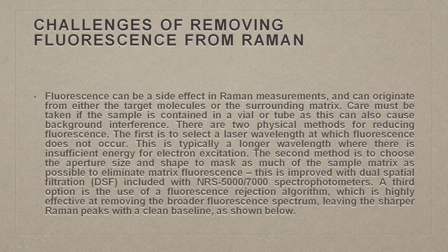So, challenges that Raman faces. Raman spectroscopy comes with a very interesting challenge of fluorescence. There is always the issue of interference with fluorescence, and there are different ways fluorescence can be removed from Raman spectroscopy. Otherwise, it becomes a very noisy signature, and many times the user refrains from using Raman. Oh, there will be a lot of fluorescence problems and so on and so forth, but that's not an issue. If you are clever, you can get rid of the fluorescence.